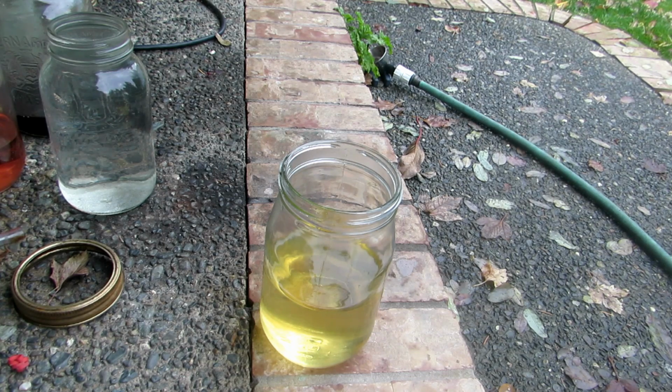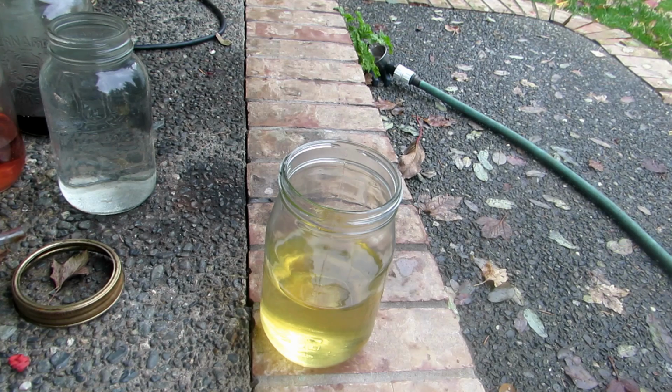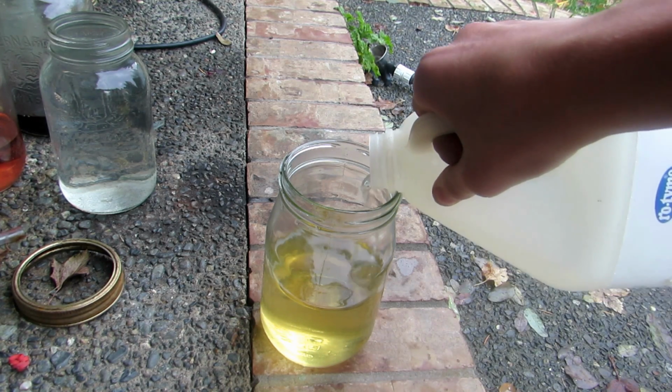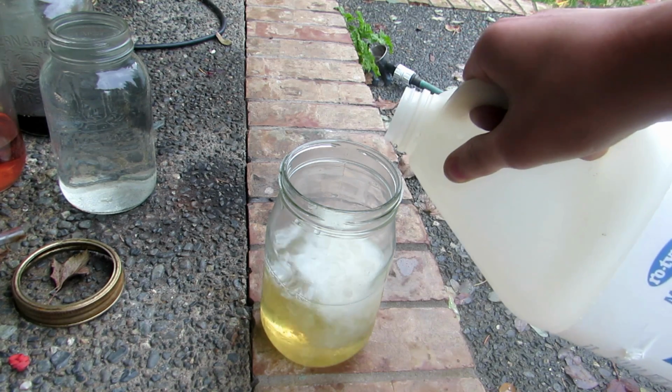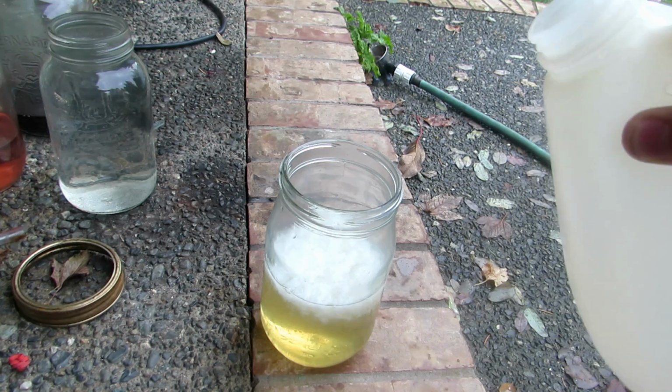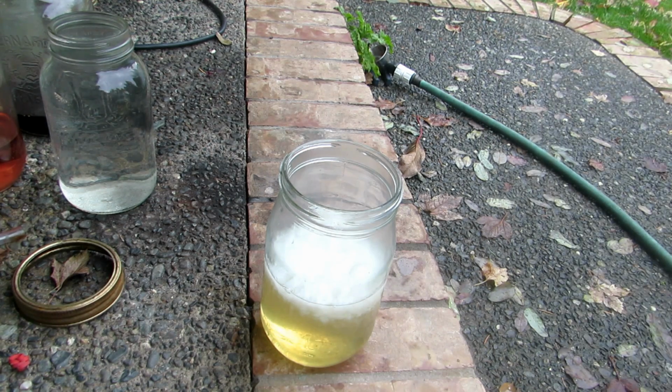Also, I'm not totally sure, but the displacement reaction of the hydrochloric acid with the sodium silicate could also be exothermic, so this should be added slowly and with caution. And we'll see if we note any changes as we add it. So I'll just start adding some. It doesn't really matter how much. Oh yes, you can clearly see that we're actually precipitating out our silicic acid. It's actually as a solid, which is very interesting.